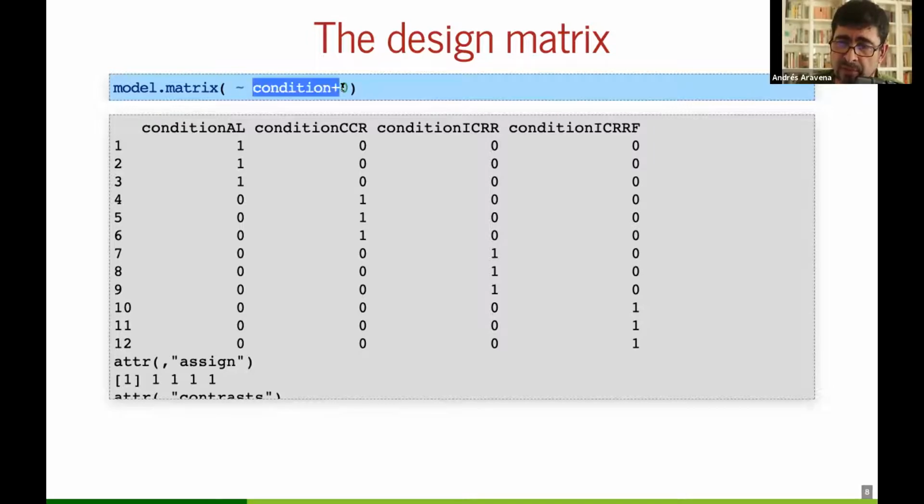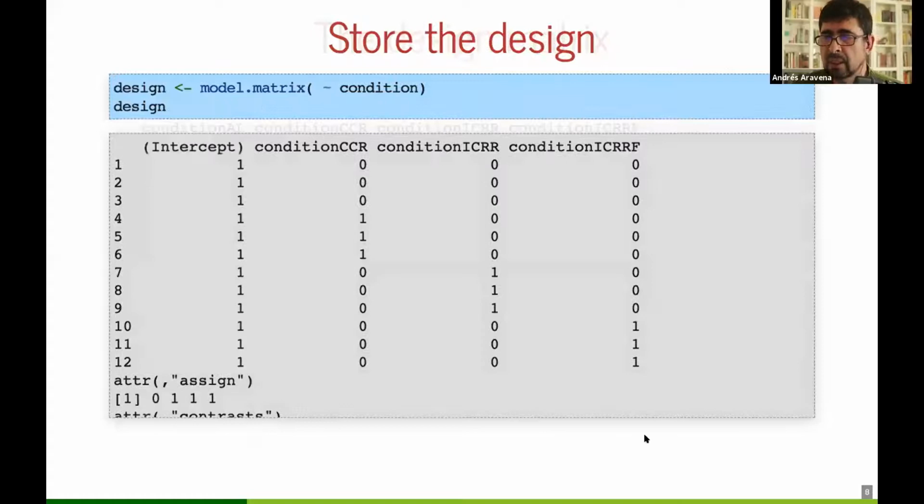The second part of the formula is represented by a matrix. You can make that matrix manually, or you can ask R to do it for you, and we will. We can save this in a variable that we call design, and after we design it, it is wise to change the names of this.